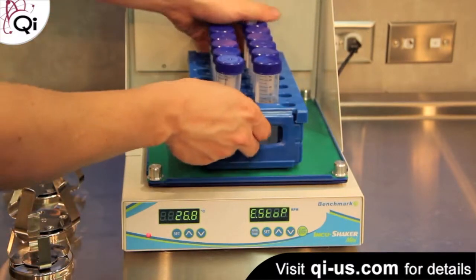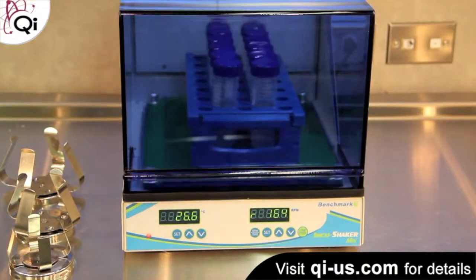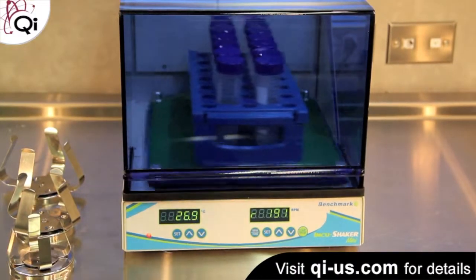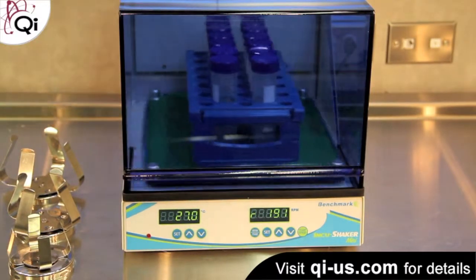The clamps can be quickly replaced. Here we replaced three flask clamps with a holder for 50 mil tubes, and as you can see it's a very quick and easy process.